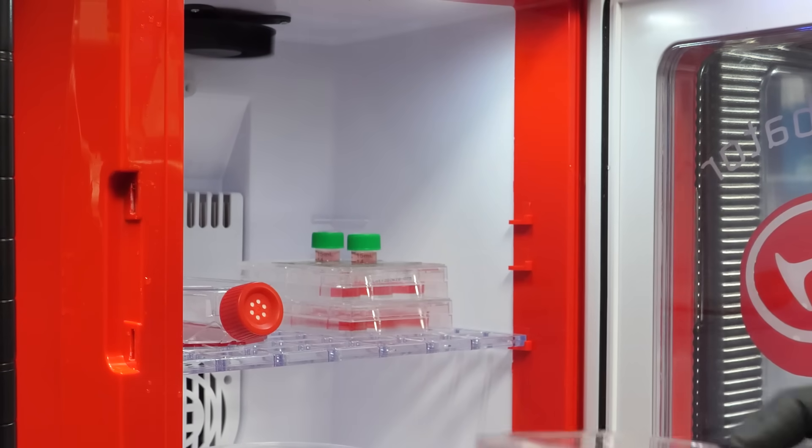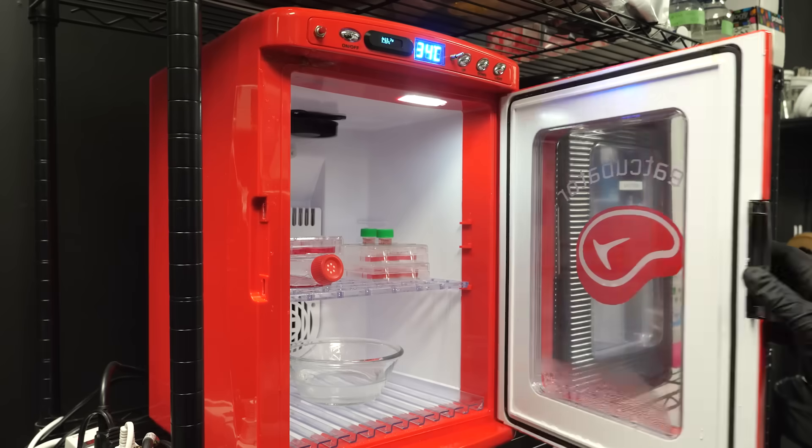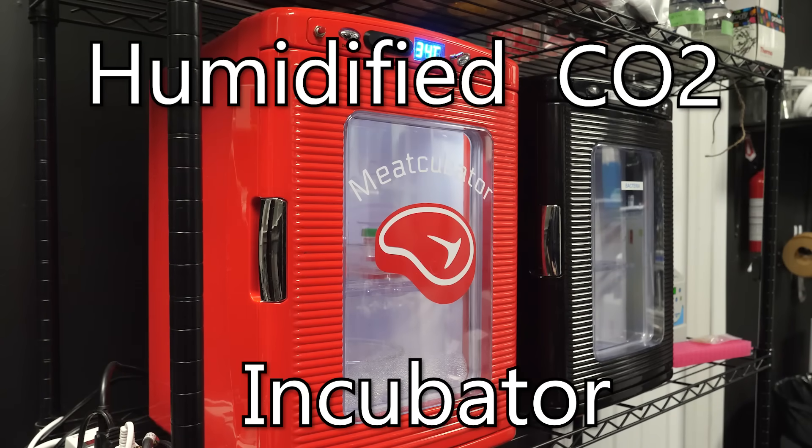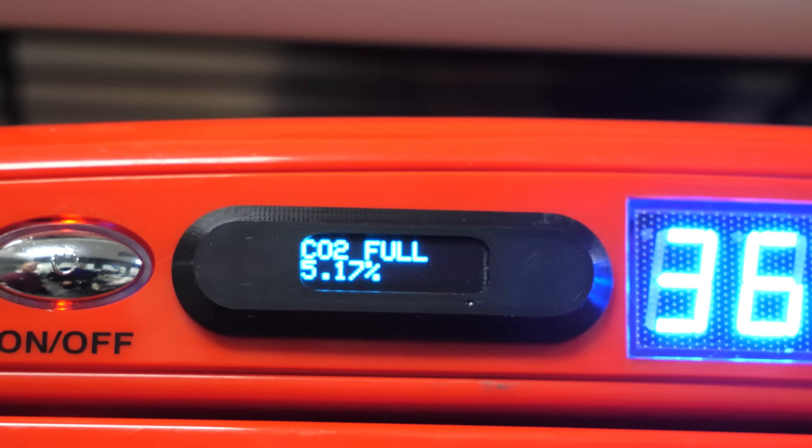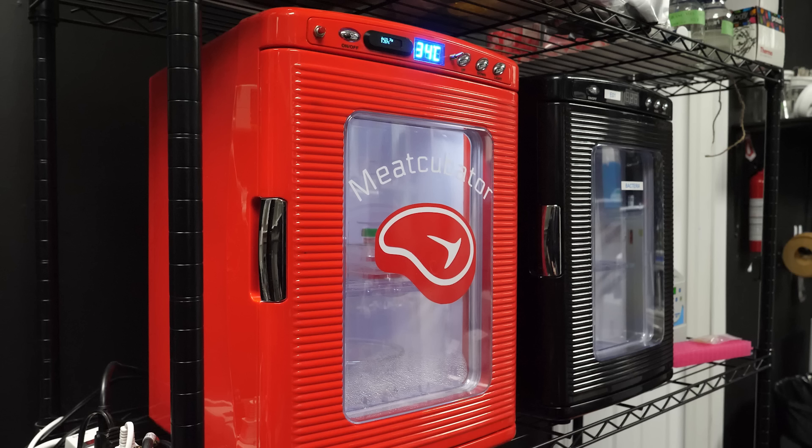This time, rather than just letting the dish sit in the hood, I put it into the meat-cubator for 20 minutes to equalize. The meat-cubator is actually called a humidified CO2 incubator, and it fills its inner atmosphere with 5% CO2. The idea is that the CO2 will diffuse into the liquid and help hold the pH at the correct level. By letting the plate sit in here for a while, the media in the wells will be at the perfect level for the cells when we add them.